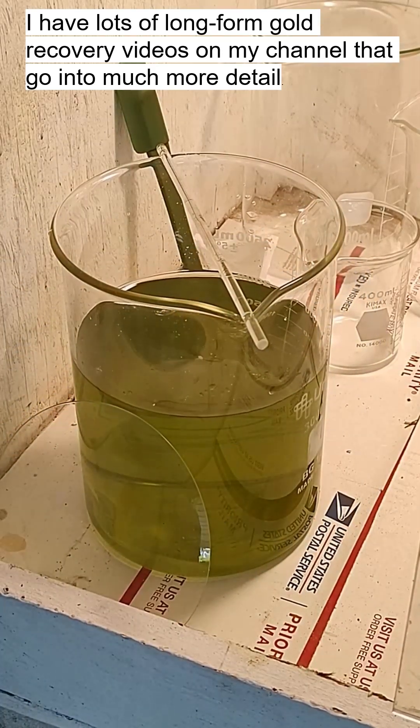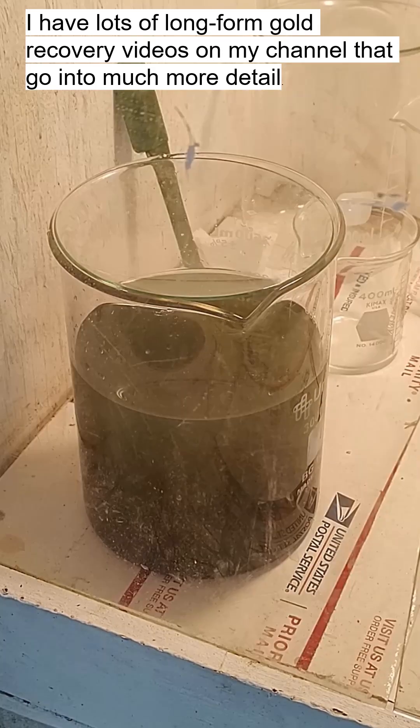There it goes. There's our color change. The gold's starting to come out of solution. We'll just let that sit and see how much gold we collect once it all settles to the bottom.